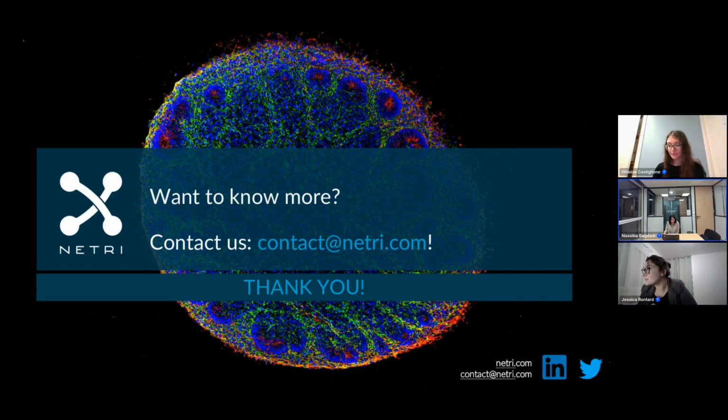Okay, so we have several other questions. What is the difference in media consumption in 24 well plate and on-chip platforms? So maybe Eloise, as you know best. Yes, it's a very interesting question because obviously in the chip, the volume is very small compared to the 24 well plates, where there is only 150 microliter in the top chamber and 150 microliter in the channel. While in the 24 well plates, we put 1 ml. Yes, 1 ml per well.